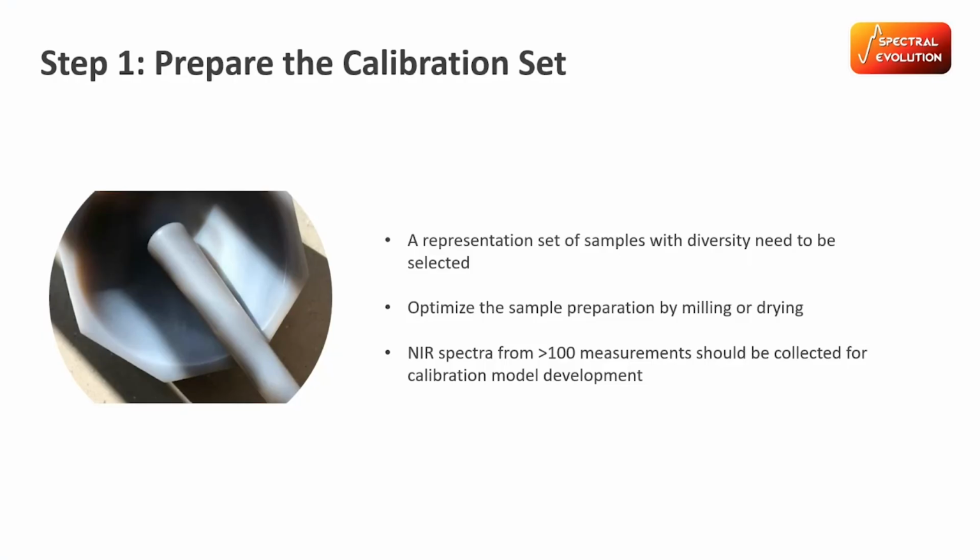And it's important to note that the more data that you use to build your model, the more accurate your model is going to be. And if you're building a model for a certain soil type, you should be using samples that are within that soil type. If you have a vastly different kind of soil, the model may not perform the same way as what you were able to see in different areas.